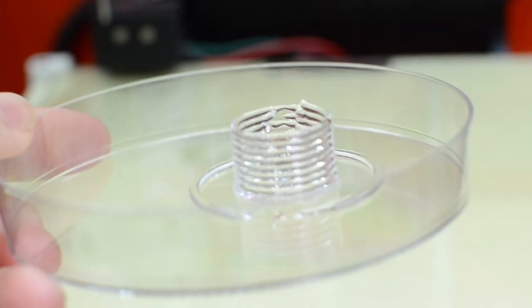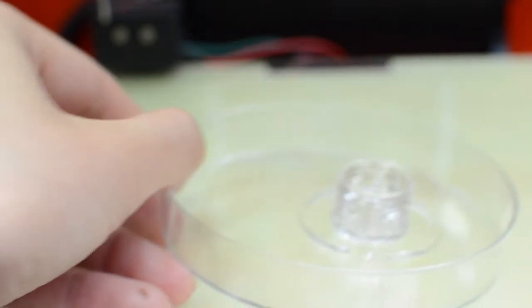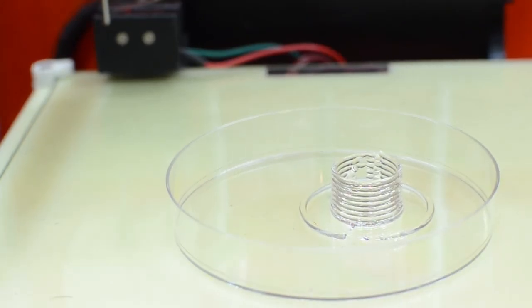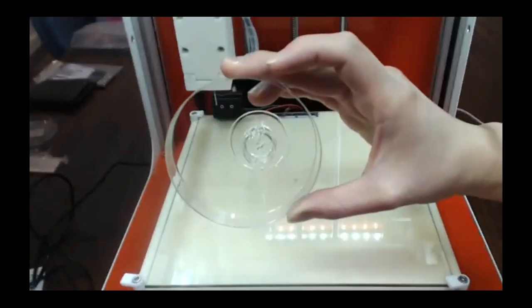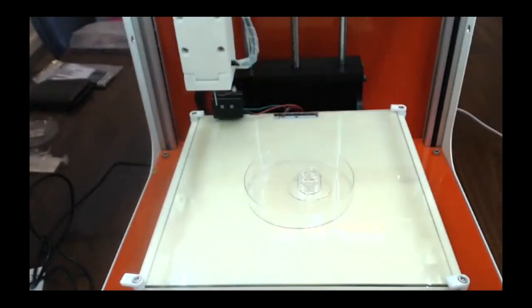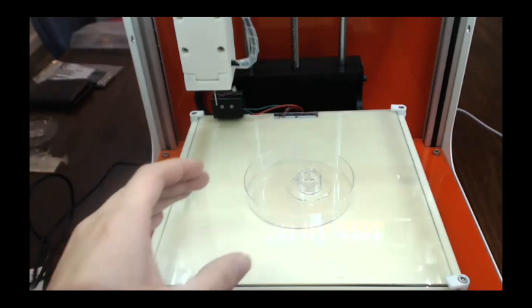And this is a good 2 centimeters of scaffold height. And as you can see, it's a very stackable material as well, so it can really hold its structure pretty well. So yeah, this is Pluronic biomaterial. And that's it for us in terms of the scaffold design today.